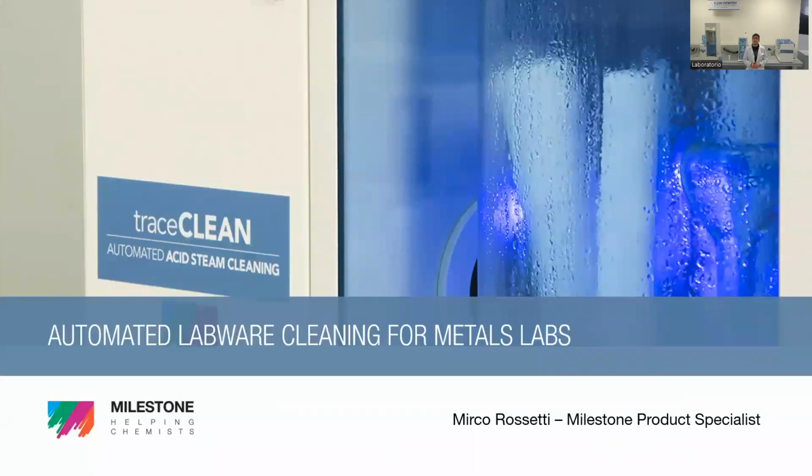Hello, everybody. Nice to see you again, and welcome back to the latest section of today's e-workshop dedicated to the total sample preparation workflow for environmental laboratories. So in this chapter, we will talk about the automated labware cleaning for environmental labs, focusing on elemental analysis.